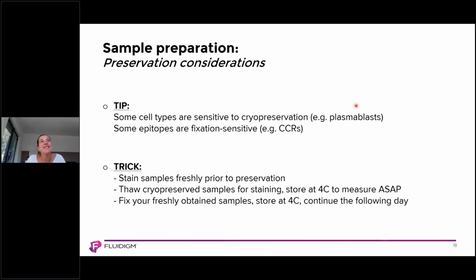The one thing really useful in mass cytometry is the fact that the metals are really robust, so you can freeze and fix your cells after staining. So it's super useful because in this way you can just stain your sample, fix them and freeze them and just acquire later, or do the intracellular staining later also.